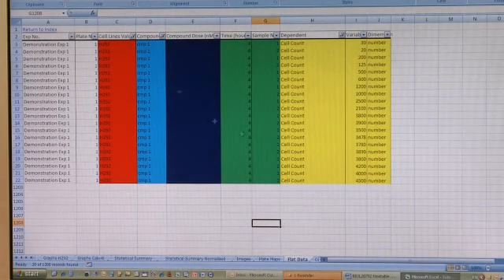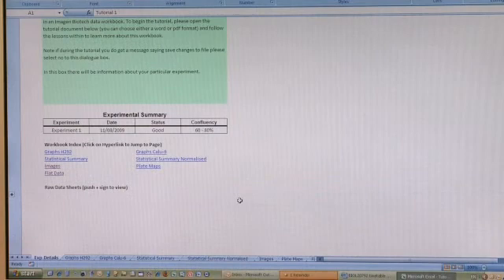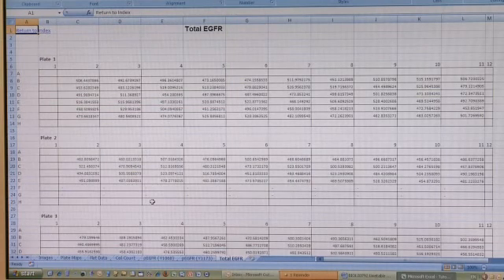Returning to the index page, you will notice again another plus key, shown here. Pushing on this gives a final list of pages which constitute the raw data pages for the experiments. If we click on Total EGFR, we are taken to a page which has the actual numbers that came directly from the array scan read. These numbers are the ones that are associated with the independent variables information on the flat data file page, as shown here.